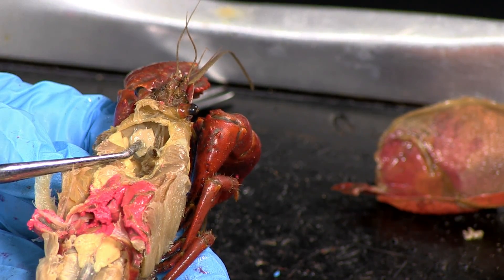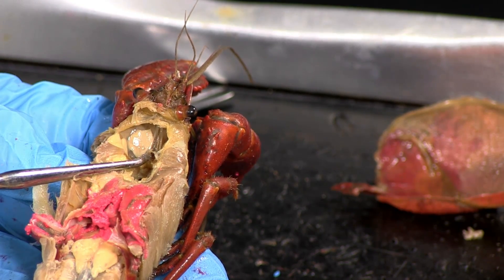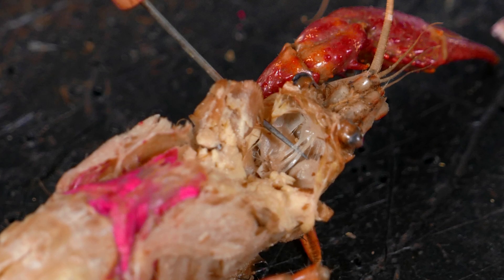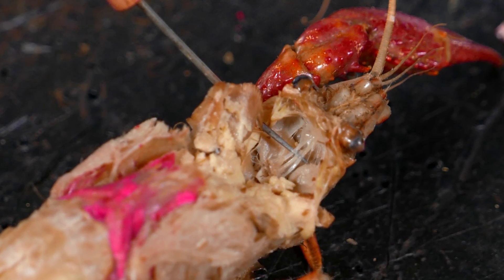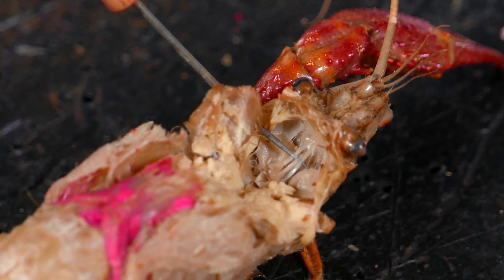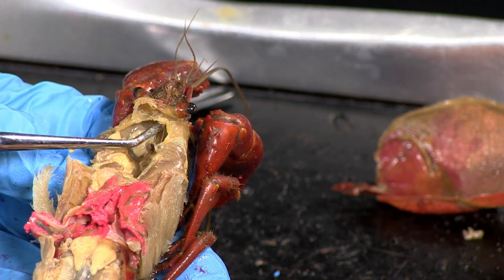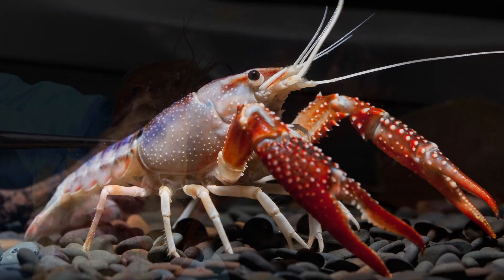The ventral nerve cord is a thin white thread similar to the spinal cord. Nerves fuse into the nerve cord at the posterior side of the brain. The nerve cord runs along the midline of the crayfish. The brain is found just anterior to the green glands. It's a small white mass between the eye stalks.